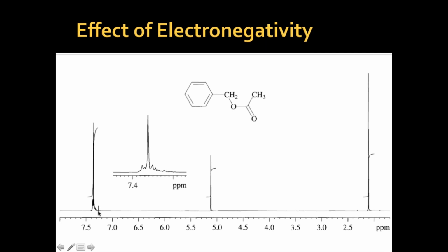You can see a very small peak at about 7.24. This belongs to the CDCl3 impurity, chloroform. As I mentioned in our first few slides, the solvent we use to dissolve the compound to check NMR is CDCl3. That CDCl3 has an impurity which is chloroform. Chloroform is here, right? All right. So this is the chloroform.